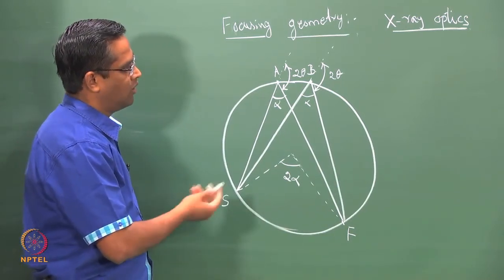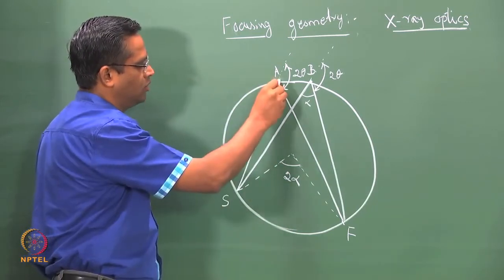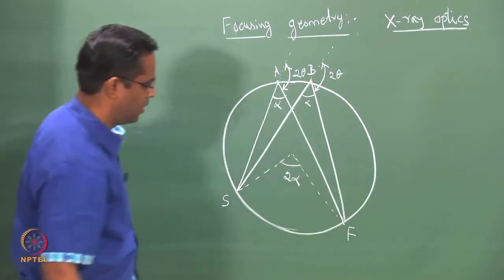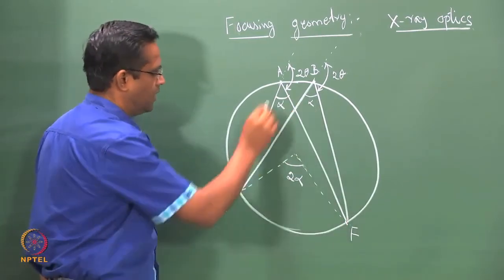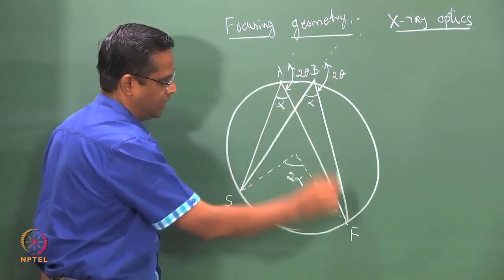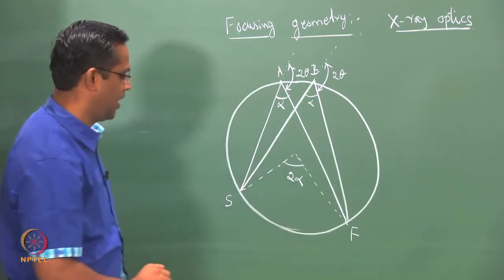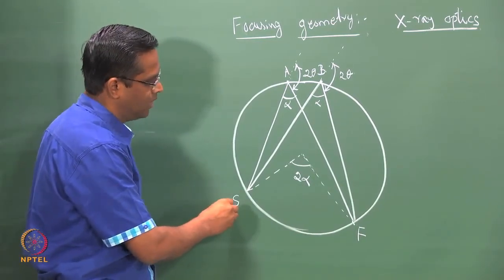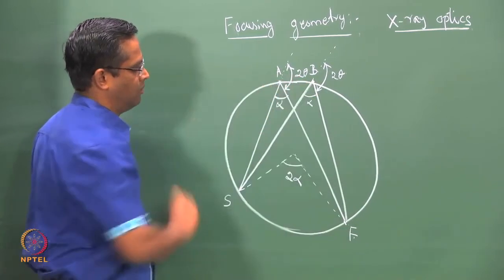And what you have to keep in mind, whenever you have the X-ray source which goes into the sample and gets back to the point F, this is the incident ray and this is the diffracted ray, they are getting focused again at a point F. So, you can say that this is a source of X-ray and this is your detector and this is your sample, for example.